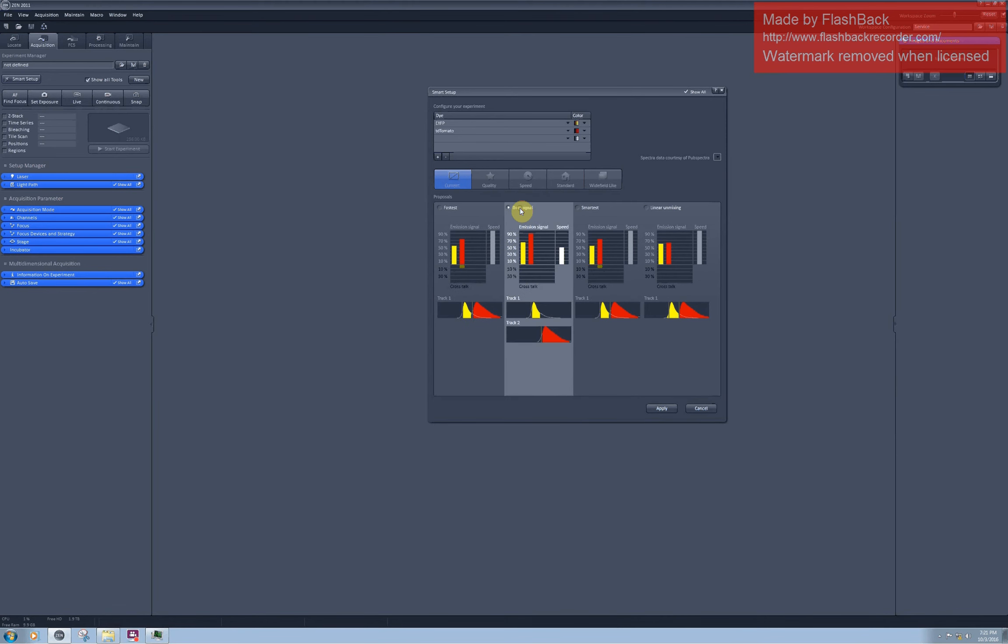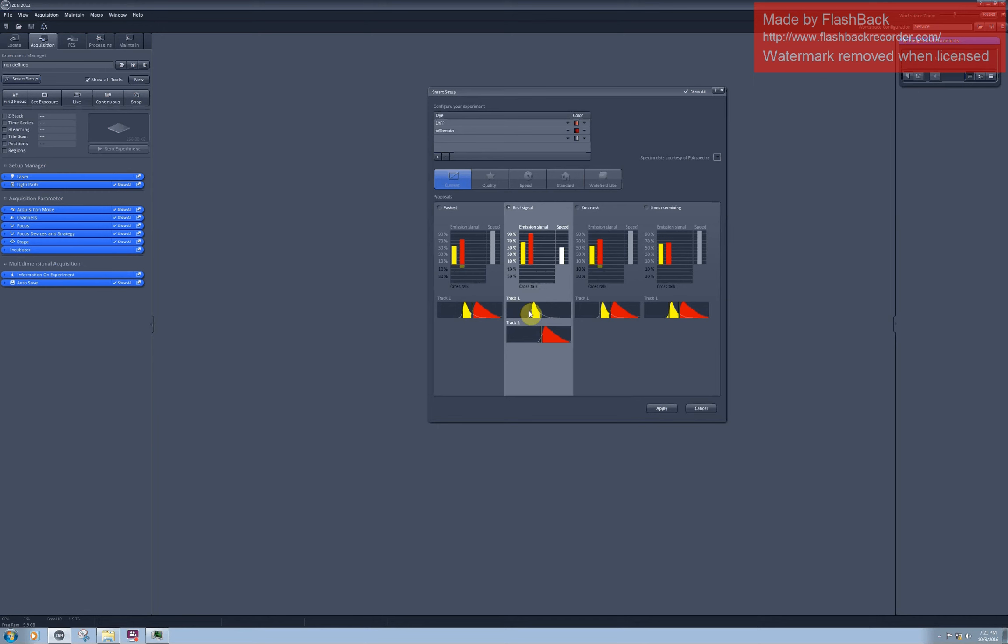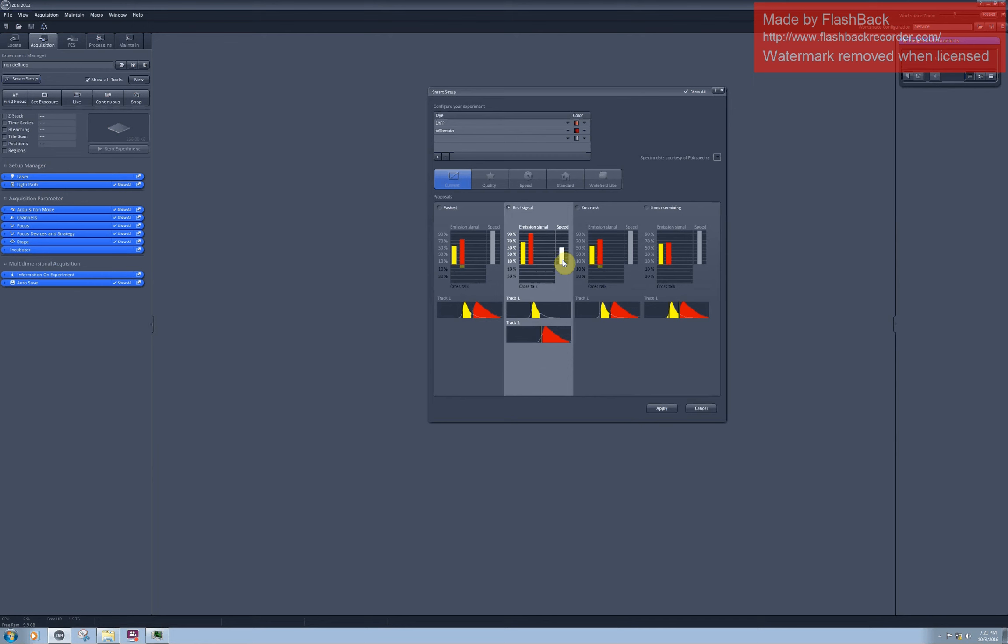Another option is called best signal. In this case, the software offers you to split your scanning into two tracks and to detect yellow fluorescent protein in track one. Here is the excitation laser for it, and you will be detecting this part of the spectrum. Then you switch off this laser and switch on the laser for the tomato and detect this part of the spectrum. This will most probably involve switching and turning the main beam splitters, changing the pinhole size, maybe even moving the prisms, and all this switching on and off will dramatically decrease the speed of scanning. But as you can see, there is no crosstalk in this case.